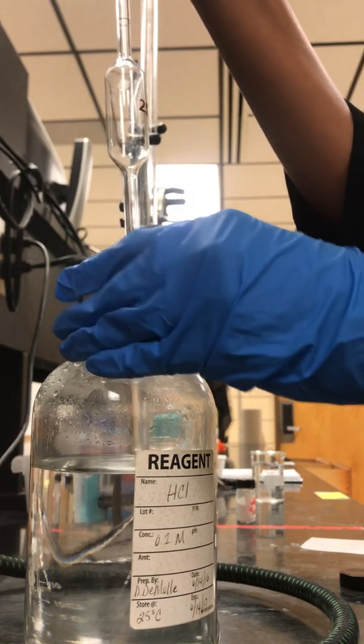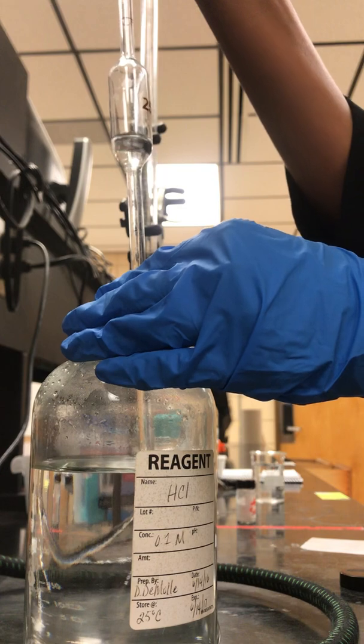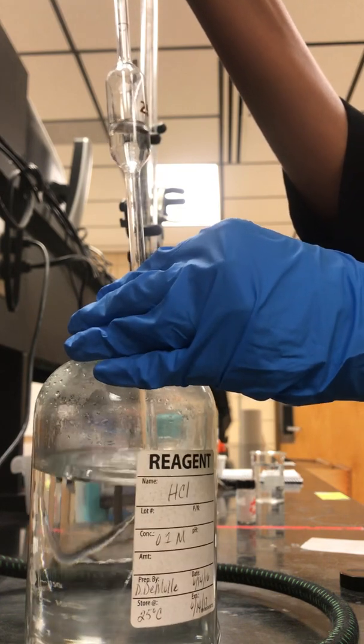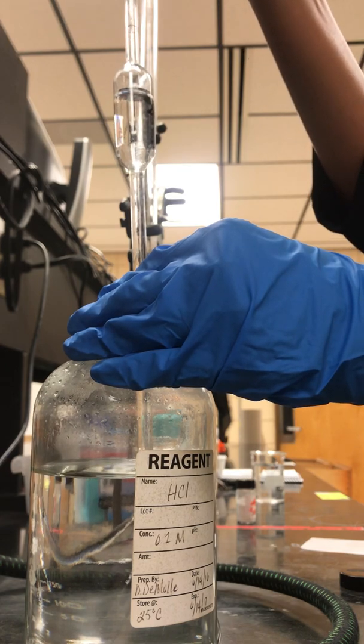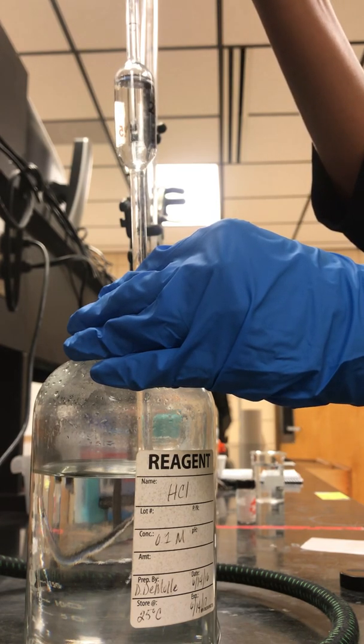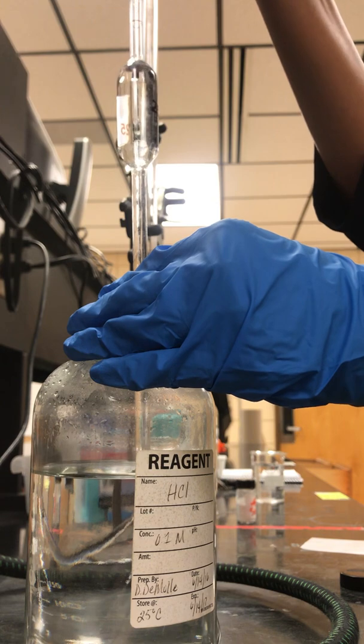You have S for suck and E for expel. Stick the tip in and press the S to suck the liquid up. The liquid goes inside the pipette. Make sure you get the meniscus right where that tick mark or graduated mark is.